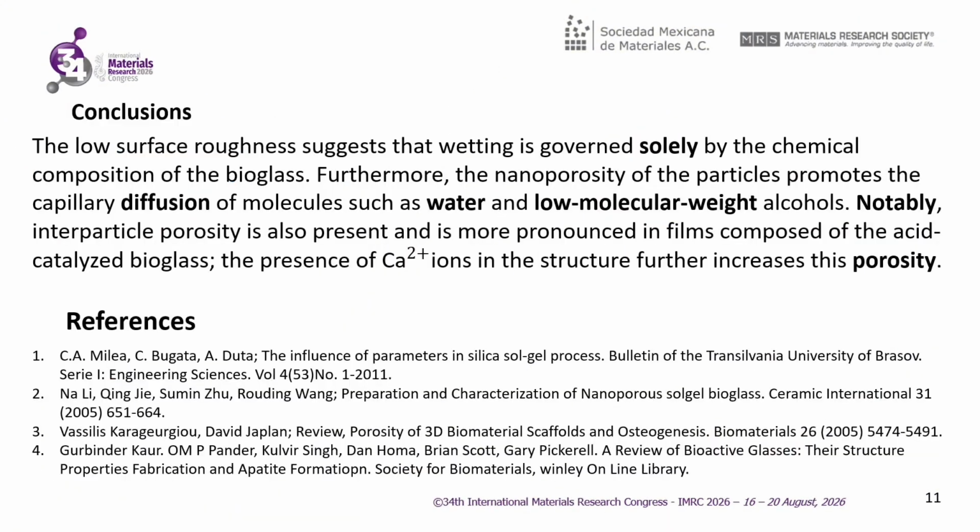The low surface roughness suggests that wetting is governed solely by the chemical composition of the bioglass. Furthermore, the nanoporosity of the particles promotes capillary diffusion of molecules such as water and low molecular weight alcohols. Notably, interparticle porosity is also present and is more pronounced in films composed of the acid-catalyzed bioglass. The presence of calcium 2+ ions in the structure further increases this porosity. These are the references we used.